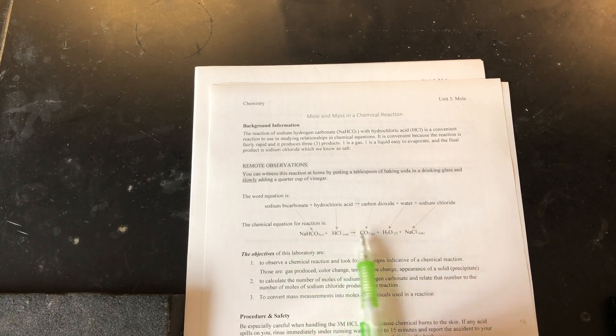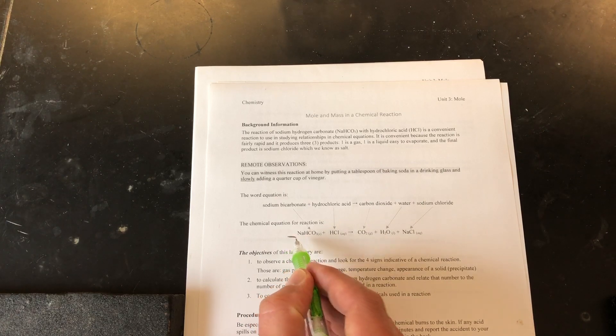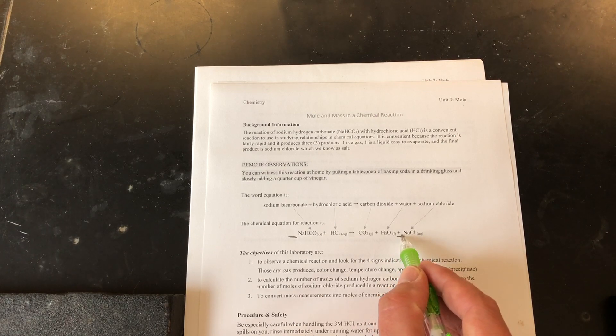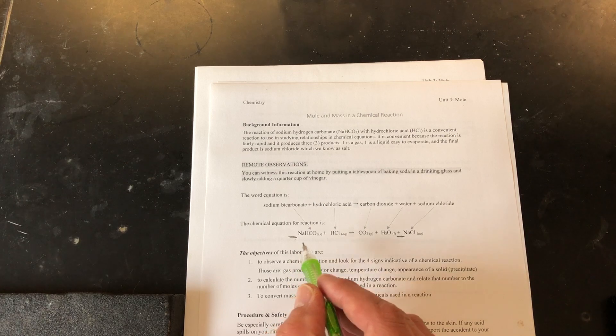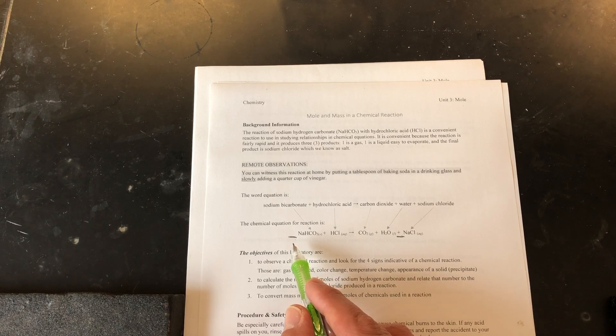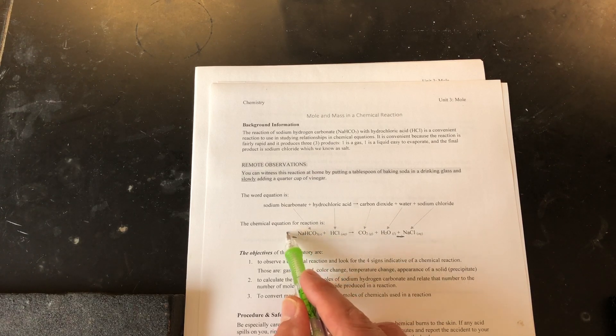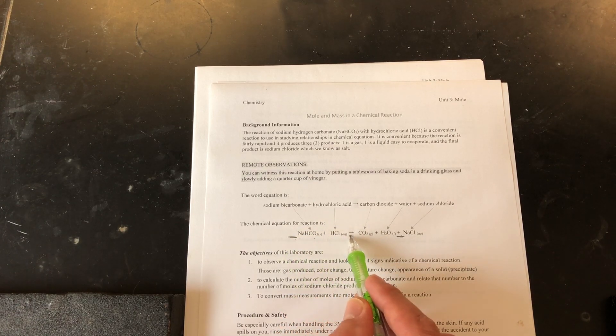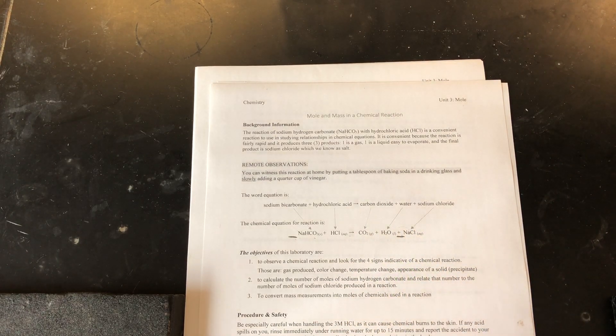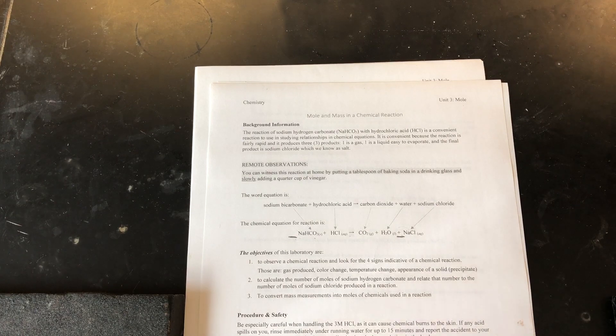After balancing this equation, the coefficients that go in front of the sodium bicarbonate and the sodium chloride, these coefficients, these numbers, will give you what the intended or the supposed mole ratio is. For every this many moles of sodium bicarbonate, you should get this many moles of sodium chloride. Your job is to now verify this ratio and see how close we came to that number.